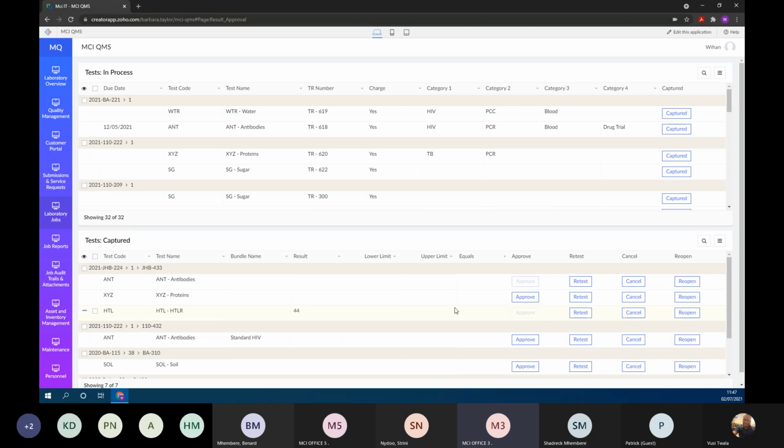It should become clear that the system not only displays these dashboards, but the theme is that during each of the stages, the receiving stage, where it's incoming work, it should be in and out. So for a batch of samples I receive, I register it, I add my samples, I add my tests, and then I dispatch it and it disappears from my dashboard. So it's no longer my problem. It moves on to the laboratory phase, where tests are then completed individually.